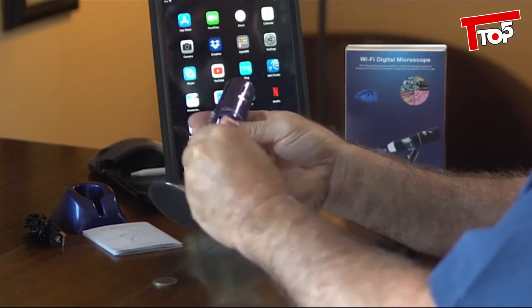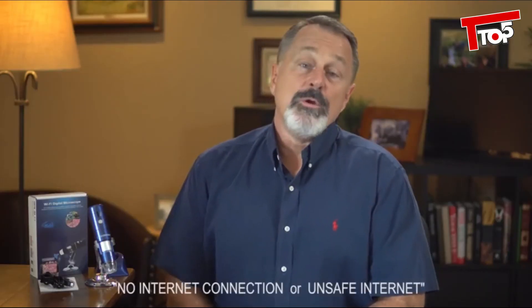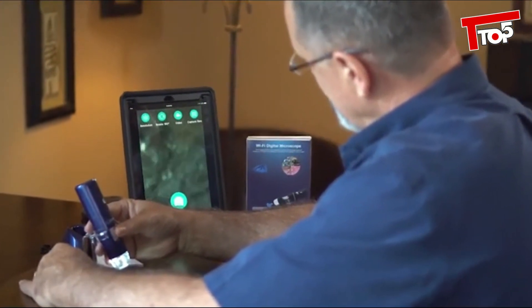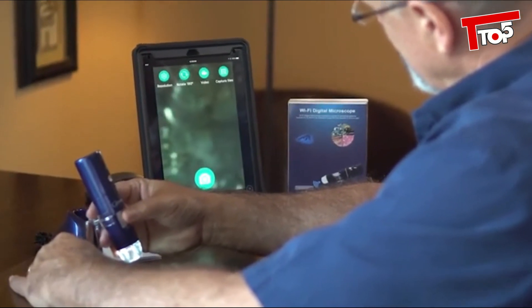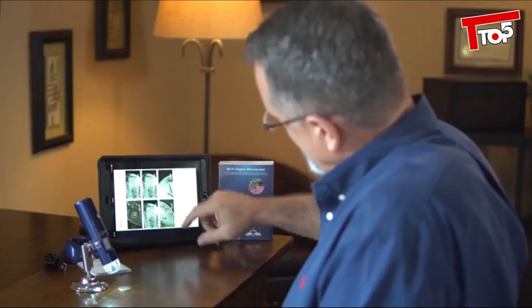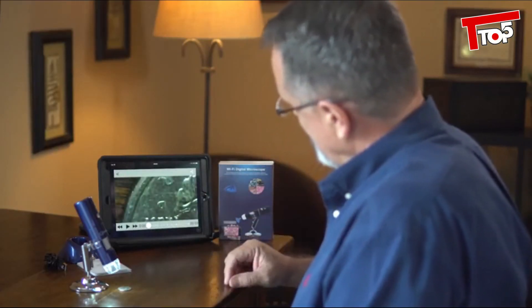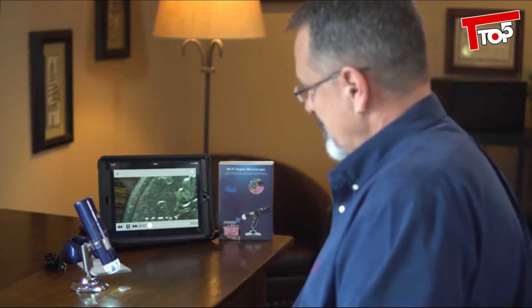Be sure to remove the protective cover. Some mobile phones might show no internet connection or unsafe internet — this just means the microscope doesn't have internet, but you can still use it by opening the app. As you can see, you can take pictures or record video, and the focus feature really allows you to get a crisp, clear view. It's perfect for the classroom, stamp or coin collectors, soldering, looking at bugs, leaves — you're really only limited by your imagination.